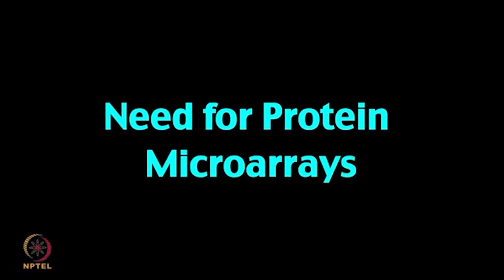So, the development of protein microarrays on which thousands of discrete proteins are printed at high spatial density offers a novel tool to integrate protein function in high throughput manner. In this animation, I will discuss different types of features and different processes involved in protein microarrays and why there is need to use protein microarrays. Before we talk about protein microarrays and how they are generated, let us discuss the need for protein microarrays.